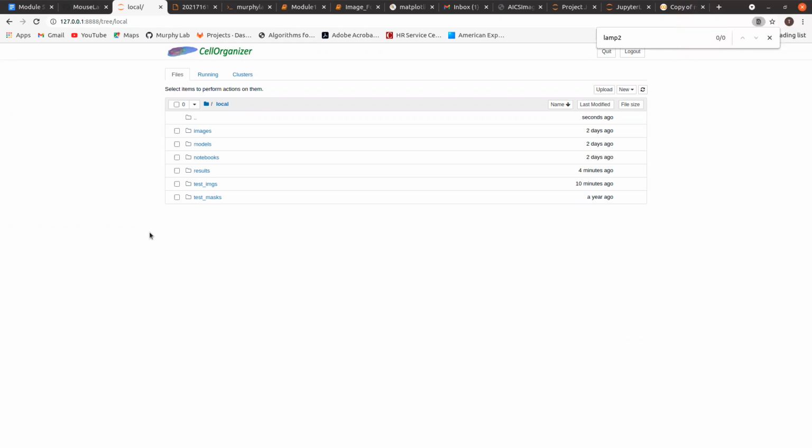I do have my own images. I don't know, it might be a little cumbersome to do this. It's a stack of images. I kind of lost track of using CellPose, and I never do this OME TIFF files. So getting the segmentation model might be a bit cumbersome. Maybe we could try it later.